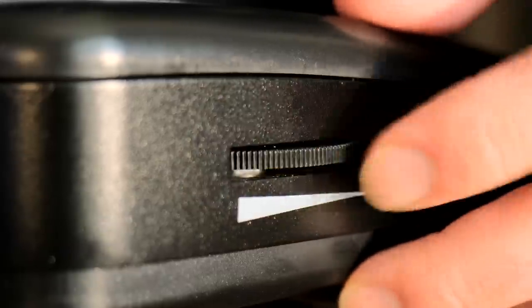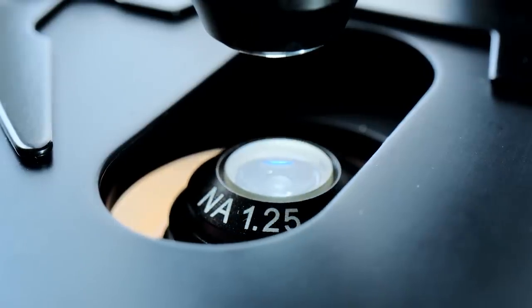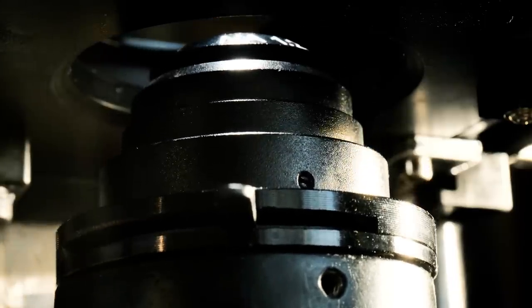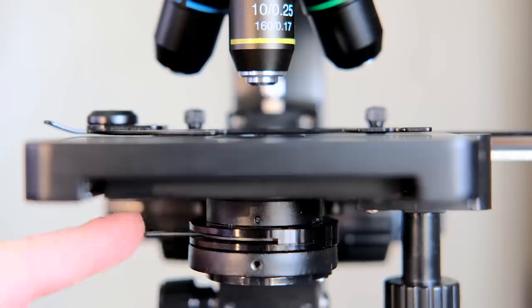There are a bunch of ways to control your microscope. You've got the amount of light coming out of the light source, and that's adjustable here. These are your focus knobs — the big one is coarse focus, the small one is more fine focus. There's also this little thing that collects and focuses light onto the slide, called the condenser. You can move it up and down, which affects how the light hits the slide. There's also a diaphragm on the condenser — a little wiggly piece of metal — that will bring the light more into a point, which can affect how the image looks. Basically, if you play around with it, you'll start to see what I mean.